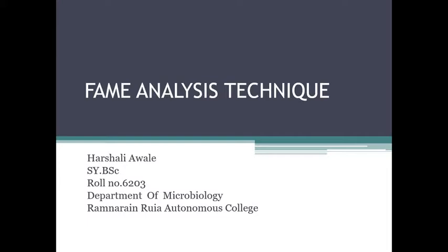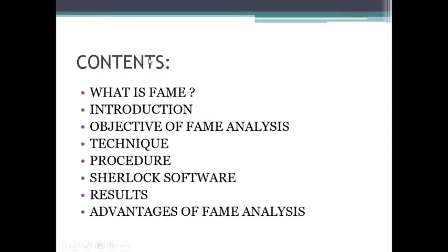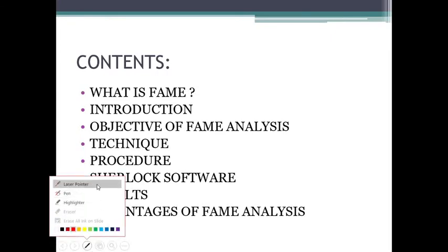Today I am going to give you a short overview of one of the important techniques in microbial taxonomy called the FAME analysis technique. This technique comes under chemical analysis. So let us see what this FAME analysis is and how it is actually done. These are the contents of my presentation, so we will discuss it one by one.